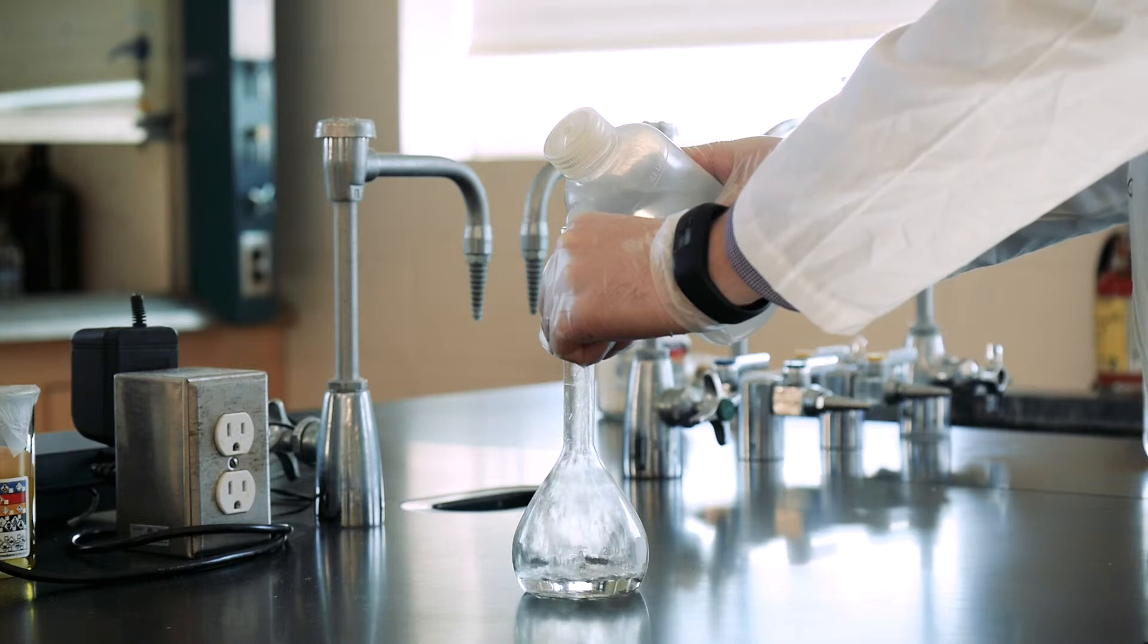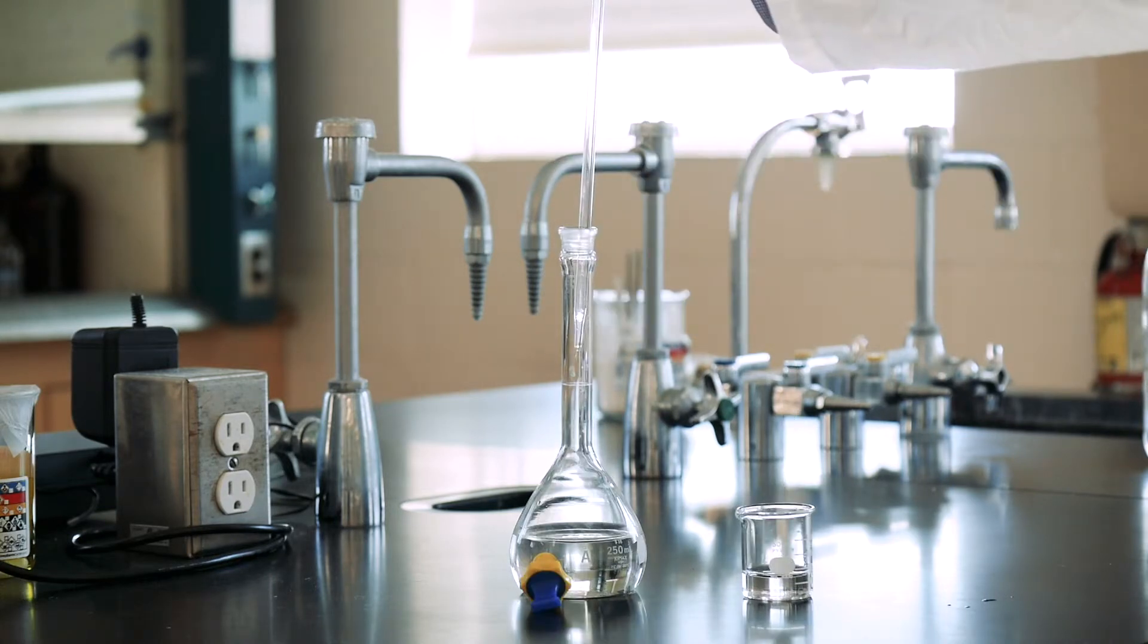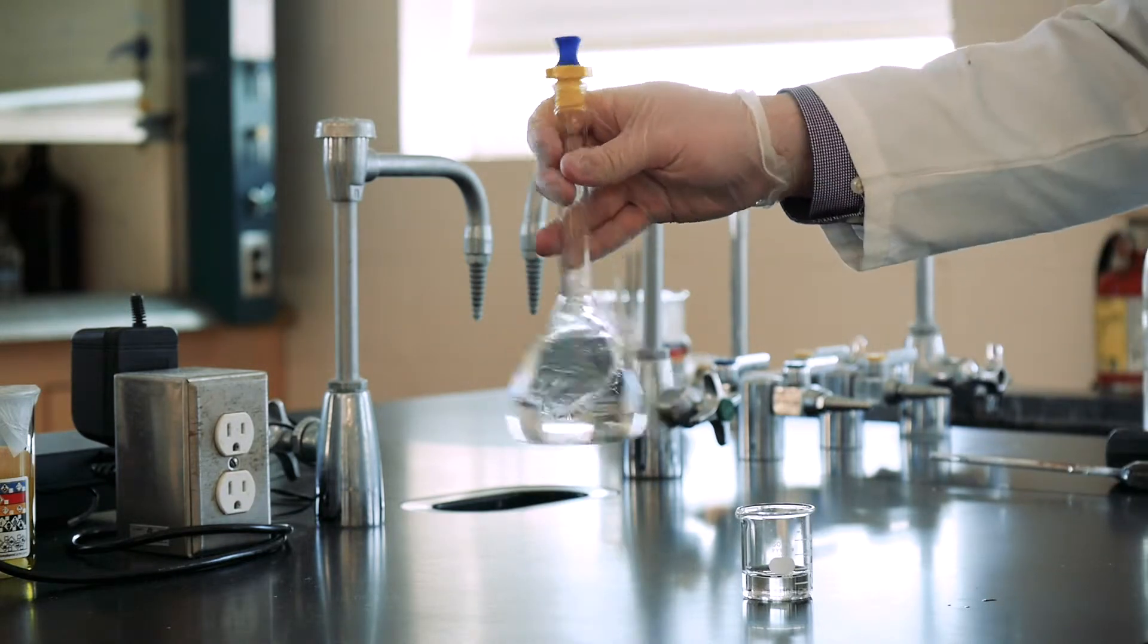Now we're ready to prepare a solution. Start by filling the flask half full with deionized water, and then add your sample to the flask. Swirl the flask a bit before you fill it to the calibration line with deionized water.